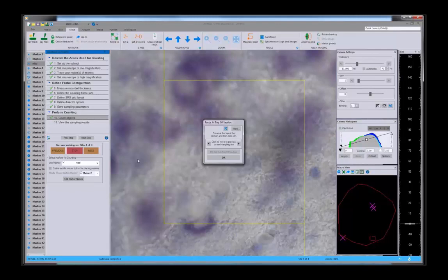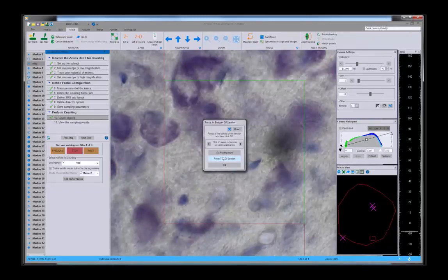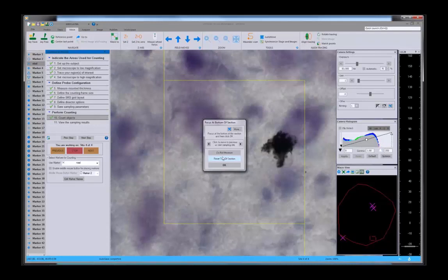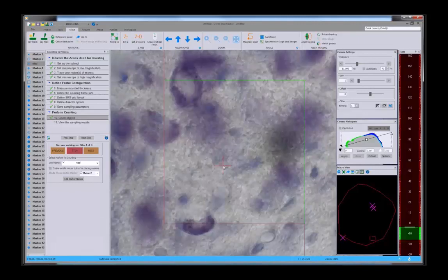This happens sometimes where part is in focus. So this is out of focus and this is in focus. So I'm simply just going to pay attention to this bottom right quadrant on the top of the section and on the bottom of the section. So I'm deciding whether I'm at the bottom based on this region here, and I think that's the bottom. And on my Z meter, you can see the map. Now we have a cell there and a cell there whose tops are too high.